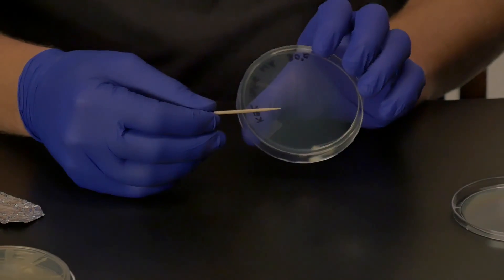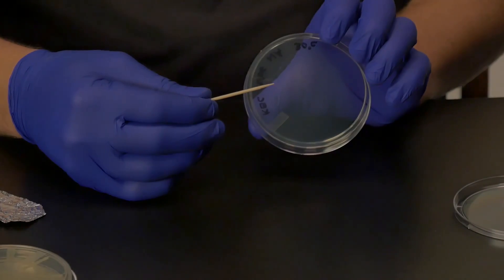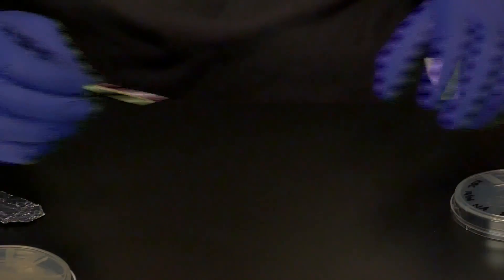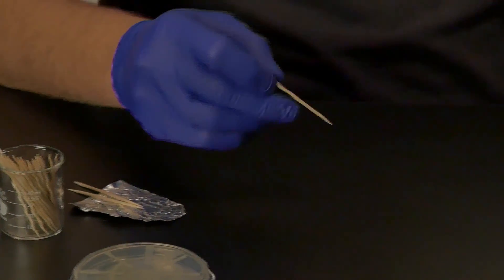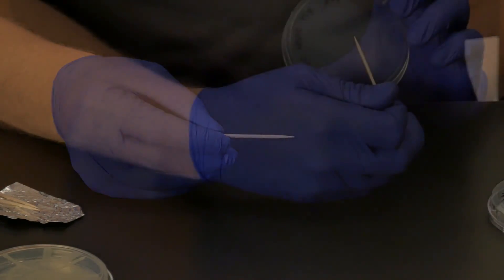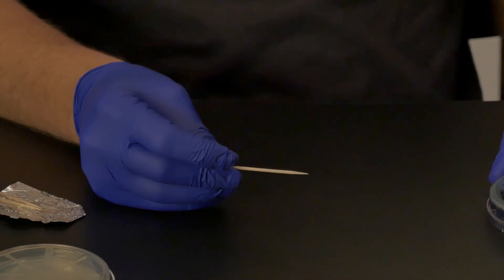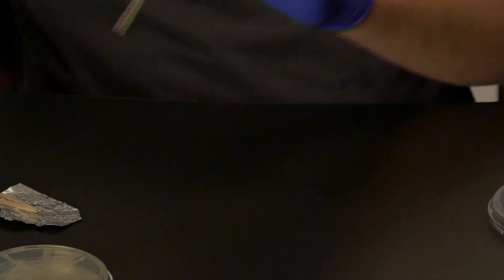With a new sterile toothpick, choose the negative control from your master plate. This is one of the bacterial isolates that has not previously shown a zone of inhibition on any of your spread plates. Touch the toothpick to your bacterial colony, then transfer it as close to the hub of the wheel as you can without touching the pathogen. Drag the toothpick towards the edge of the plate and through the outer ring that you produced with the pathogen. Discard this toothpick and do the same thing with the negative control at a different location on the plate.